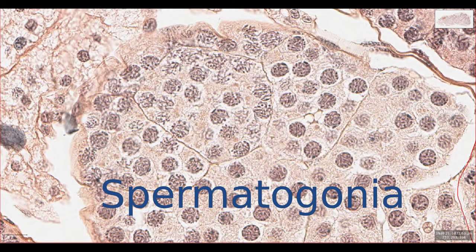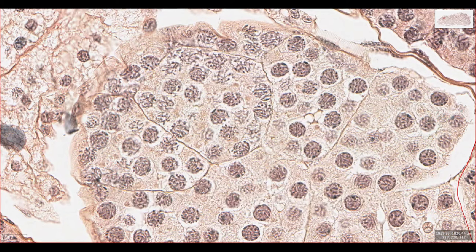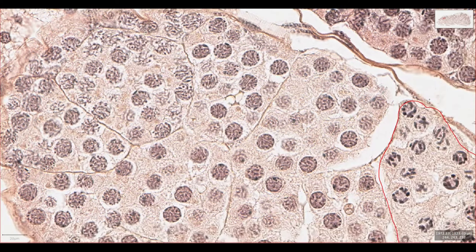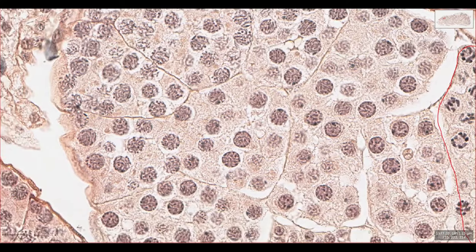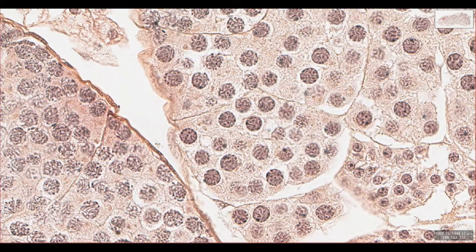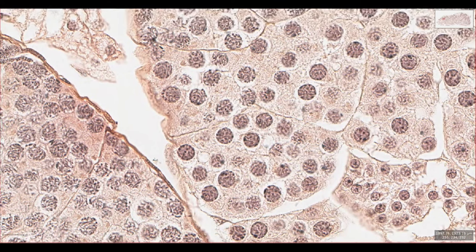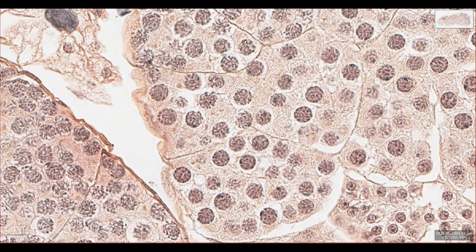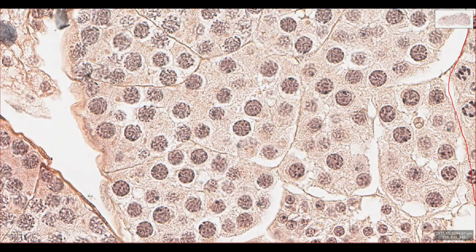Most of what you can see here are spermatogonia, which are produced by dividing germ cells. Each spermatogonium will be encircled by cyst cells, which is sometimes barely visible at the periphery of each group of spermatogonia, and here we can see groups of spermatogonia within their cysts quite clearly, although I found it very challenging to find any cyst cells.